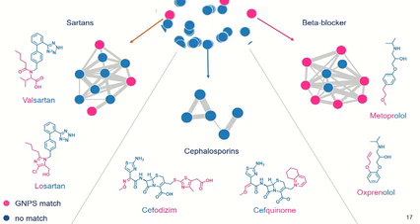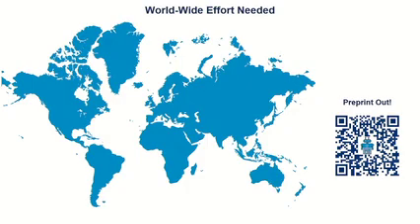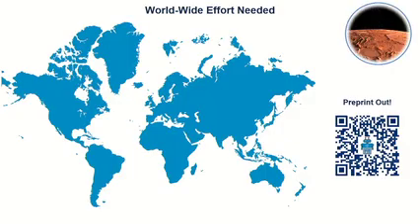And then, of course, you have clusters that are totally unknown, and you would not know anything about them. In our case, this was for the cephalosporins. So if we would not know this was our reference standard, it would be blind what we want to look at in this case.